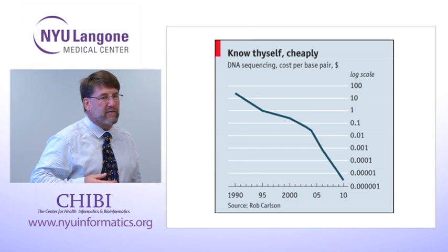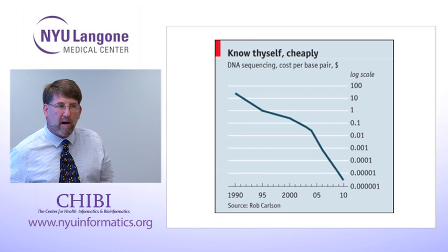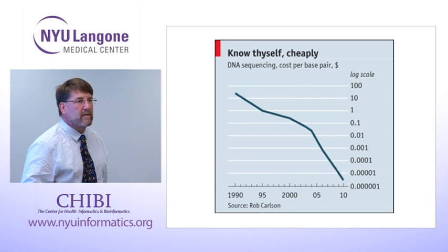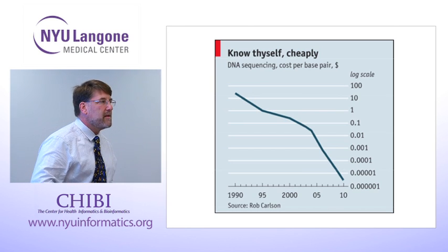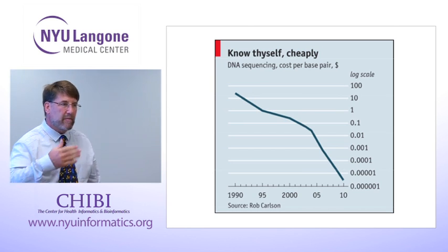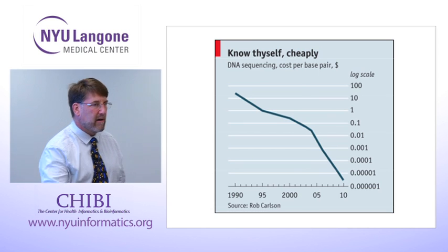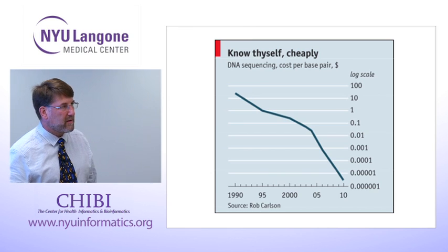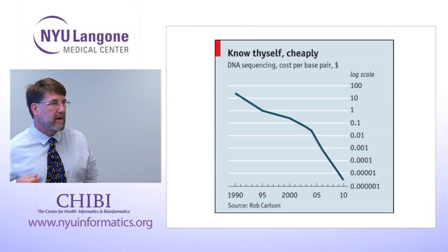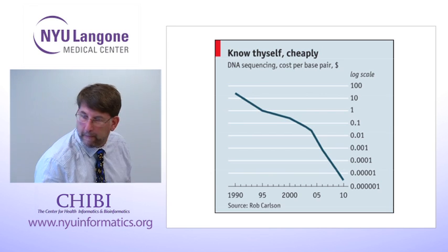And the real challenge of cost now is the time for data analysis and the costs of data management. So if we can streamline and automate the data management process, then we can continue to bring down the cost of RNA sequencing for a variety of different types of experiments, and perhaps improve the quality of gene expression measurements by doing more replicates, deeper sequencing, etc.